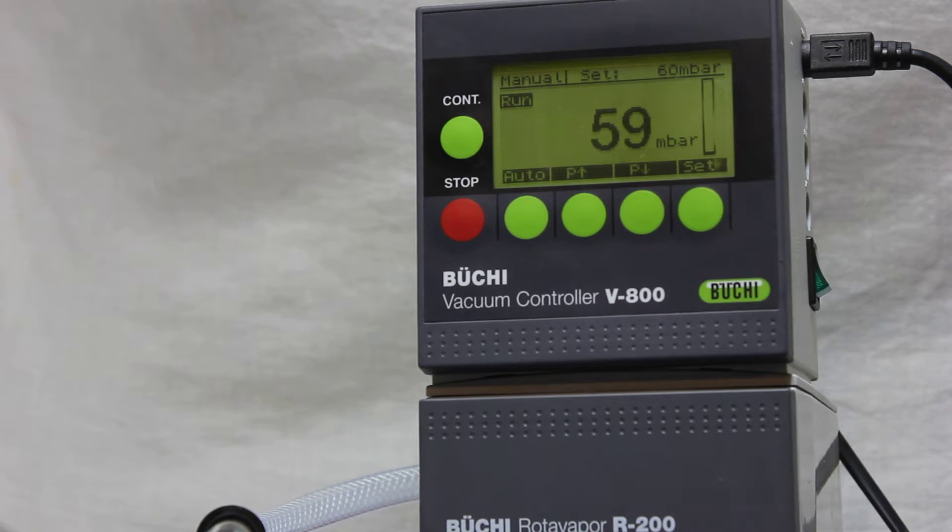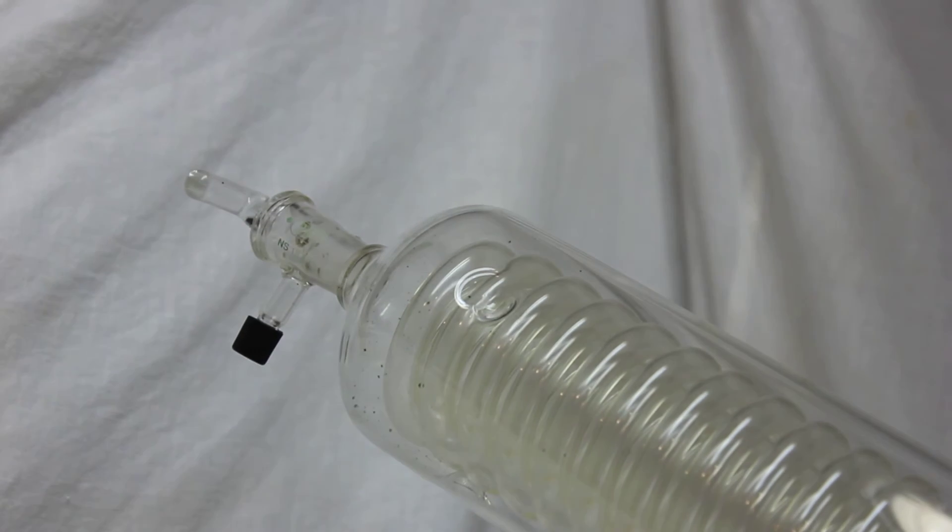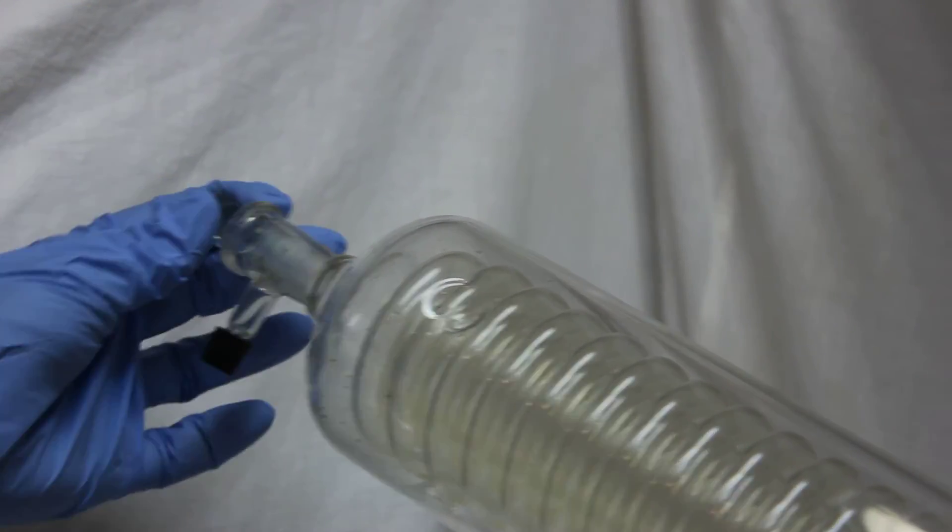Now I'm going to open this again a little. You can see it immediately drops, then it stays, and the pump just stays off. Once again, this shows that the sealing system is perfectly fine. I'm going to open it one more time.